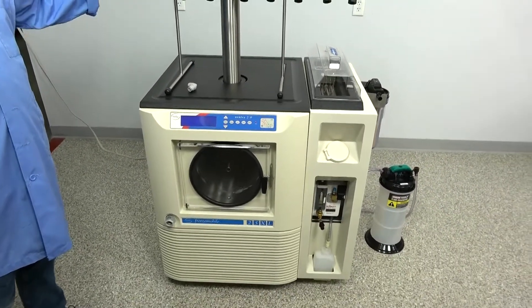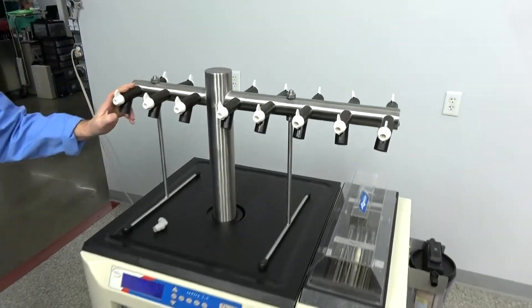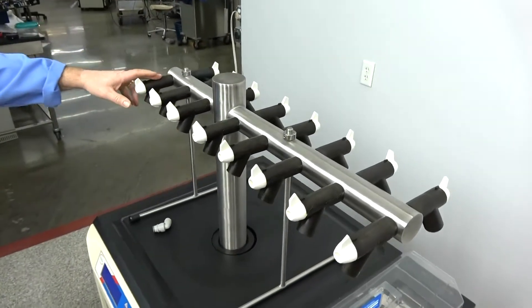It also comes with the TRE MANAVOLT, which has 16 included ports on it, with all the valves working great.